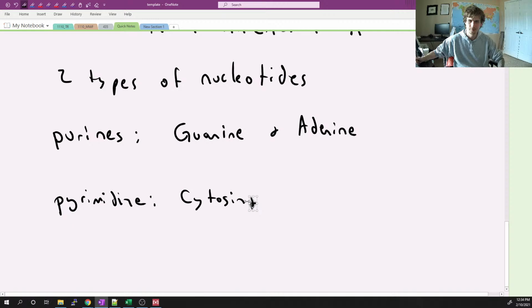And given this kind of information, we'll see two types of mutations, or two types of substitutions. We'll see the transitions, where a G will be substituted for an A, or a C will be substituted for a T, right? These are transitions.